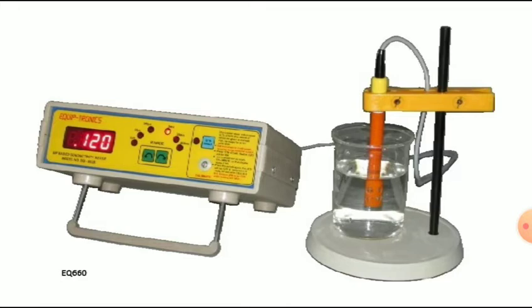On the right-hand side, in the beaker they have kept the solution, in which the conductivity cell is inserted. The conductivity cell we can discuss later. The orange color conductivity cell will be connected to the conductometer, and this is the assembly to measure conductance of a solution.